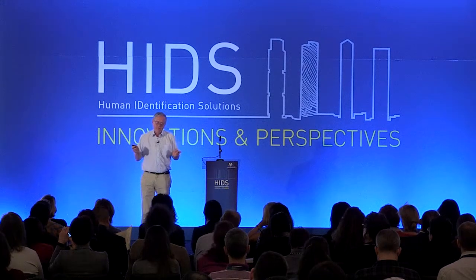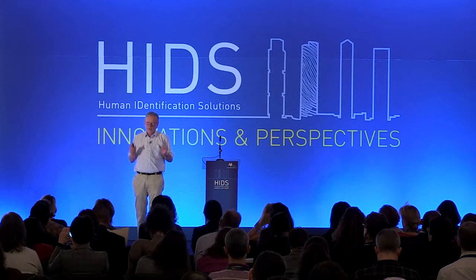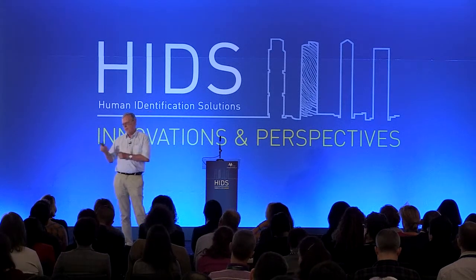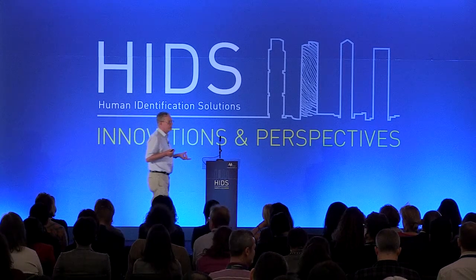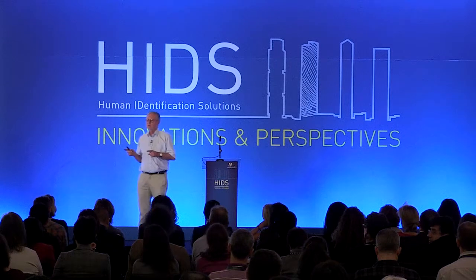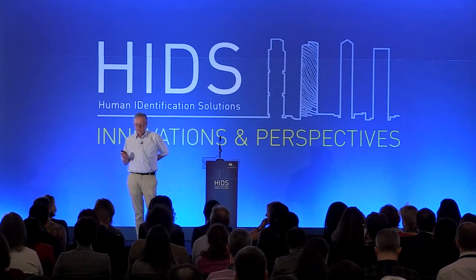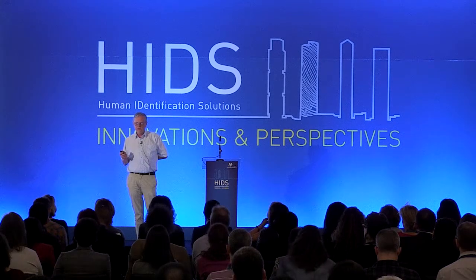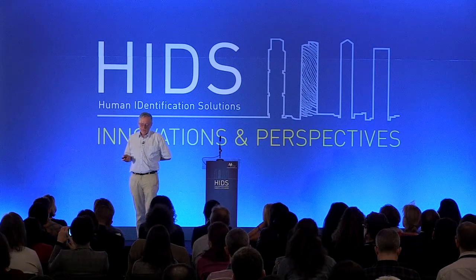But I think it's essential that you include flanking regions for this purpose, so that you are sure that you have sequenced these things correctly. And I also think it's very nice to have the possibility to see the flanking region sequences if necessary. That's a good idea as far as I can see, and we have published our ideas of how to do this, and you can see it here. It's a rather old thing now.